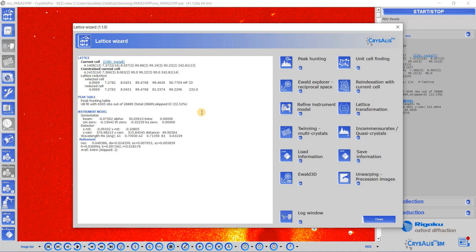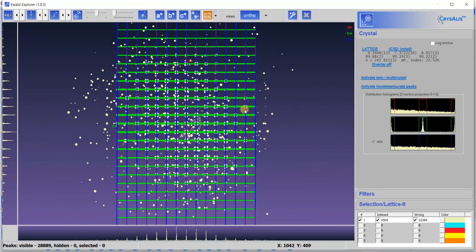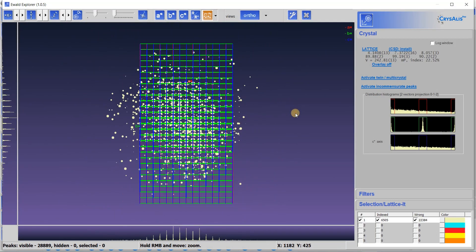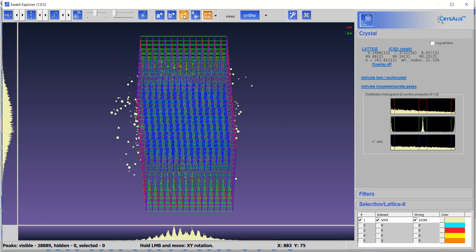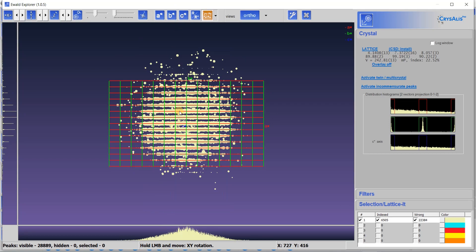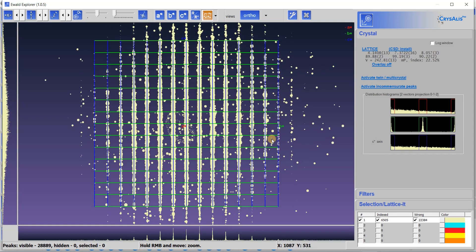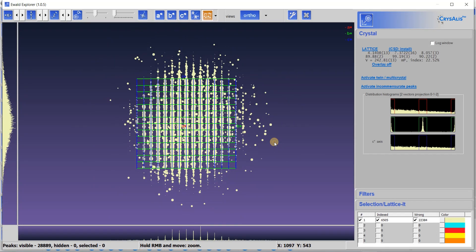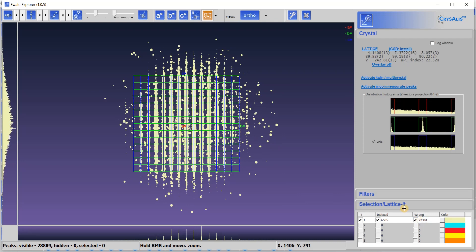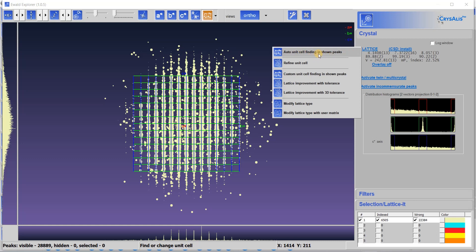This low indexation is probably due to twinning. So let's go to the reciprocal space viewer — just press here. If I look along the C axis, B axis, or A axis, the unit cell is definitely wrong. It's also showing some 22,000 wrong reflections, and the histogram is not good. So go to Lattice and select 'Auto unit cell finding in Swan Peaks.'